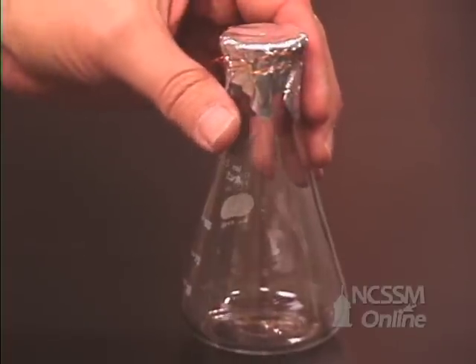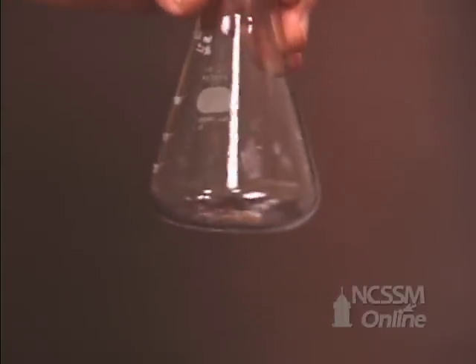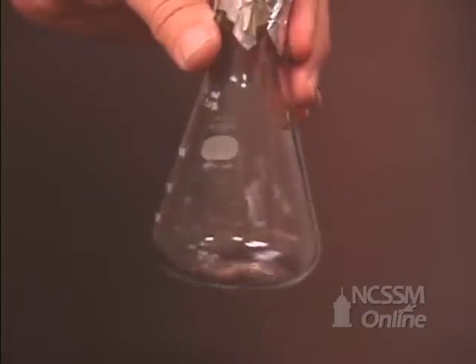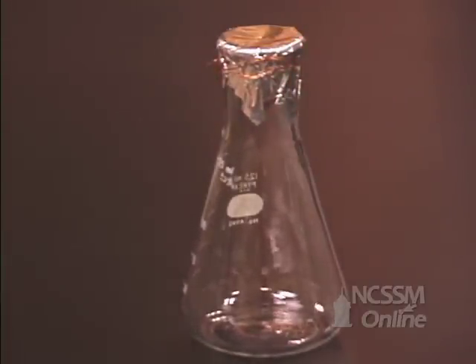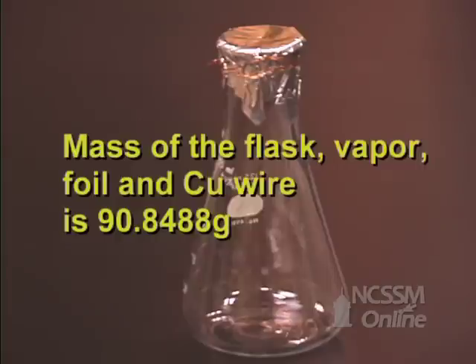When the flask is cooled to room temperature, the liquid that has condensed was the amount of vapor that would fill the flask at the temperature of the boiling water bath. We will now mass the flask, the liquid, the aluminum foil, and the copper wire.